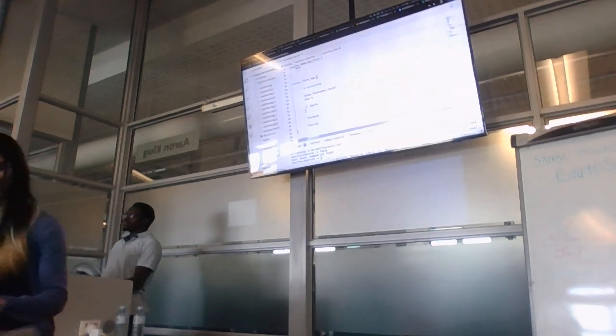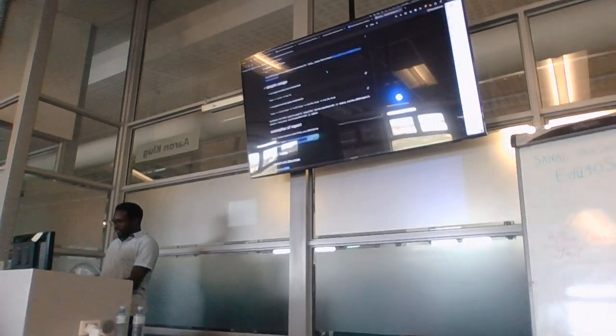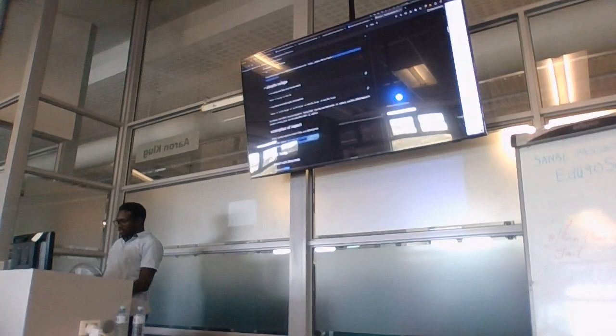Our inputs. So what do we expect this tool to consume? If you look up on the internet, a simple list of commands, you need your first read forward, and then reverse, and the output the same. The only difference is that those options have different flags specifying forward and reverse reads. So already we have an idea of how the script should look.